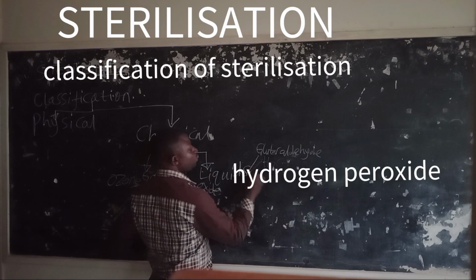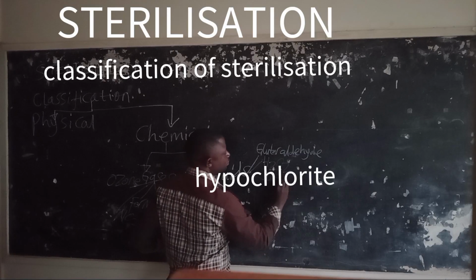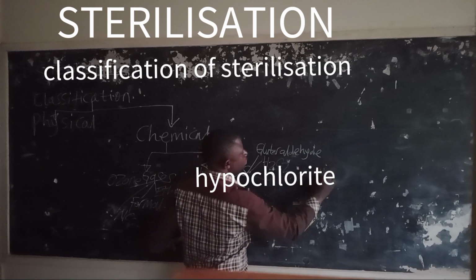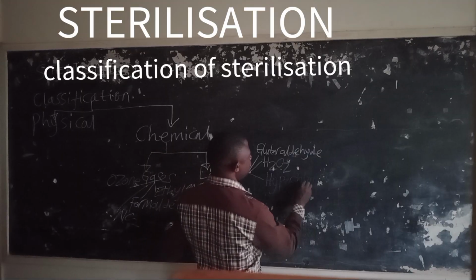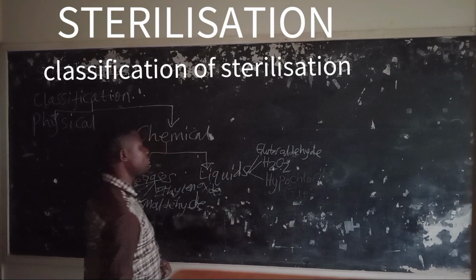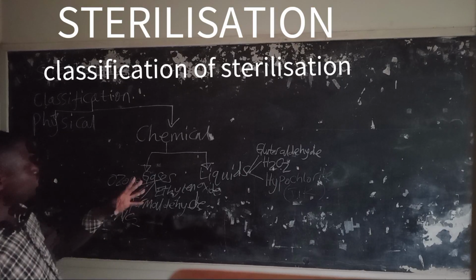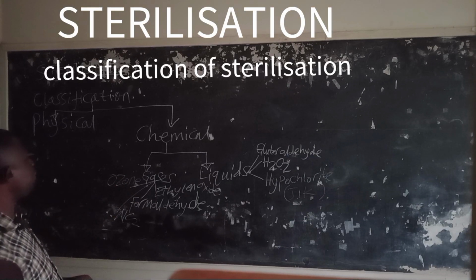We have also hypochlorite. This one we normally go to buy locally here. This is what we go and buy as jik. The hypochlorite. So this is categorized under chemical sterilization.